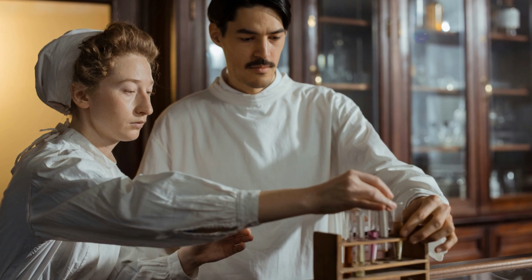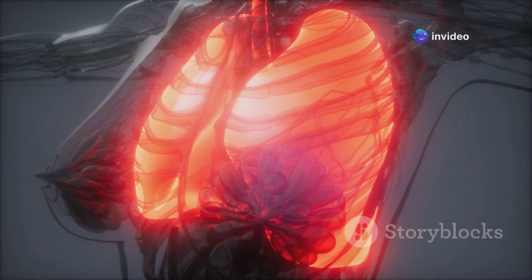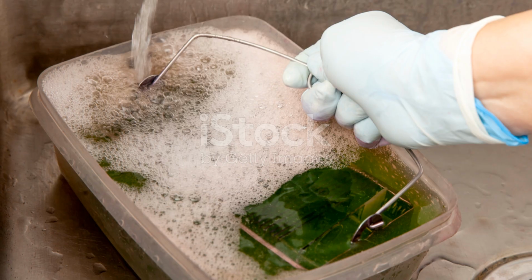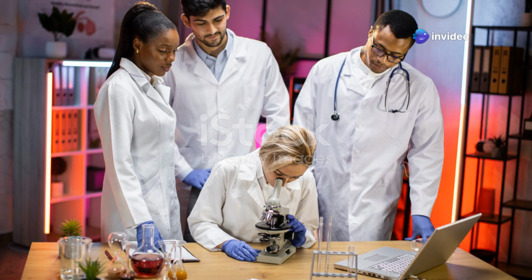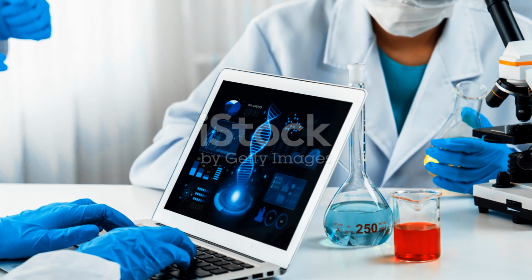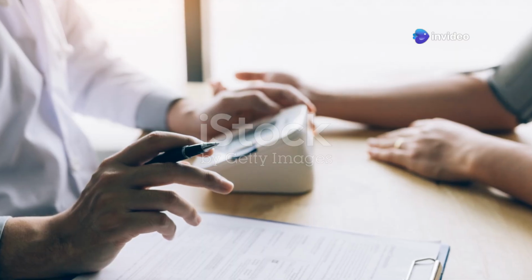This ingenious staining method was developed by Danish scientist Hans Christian Gram way back in 1884. He was examining lung tissue from patients who had died of pneumonia. He noticed that some bacteria retained the crystal violet stain after treatment with alcohol, while others did not. This observation led to the development of the Gram stain, a technique still widely used in microbiology labs today. Pretty neat, huh?